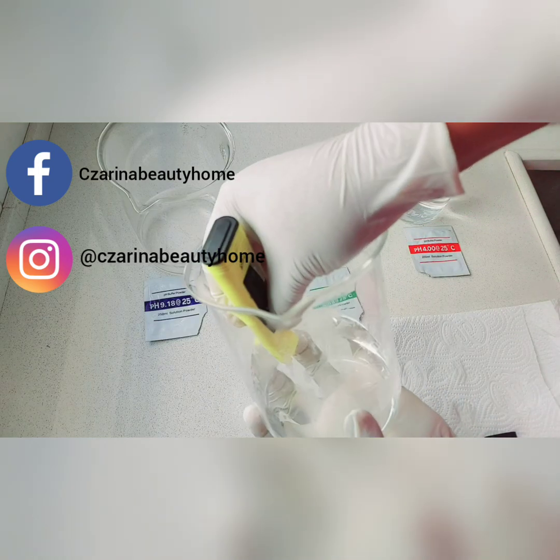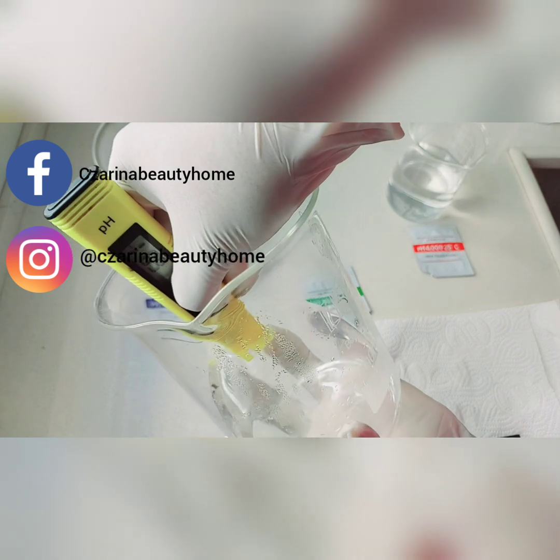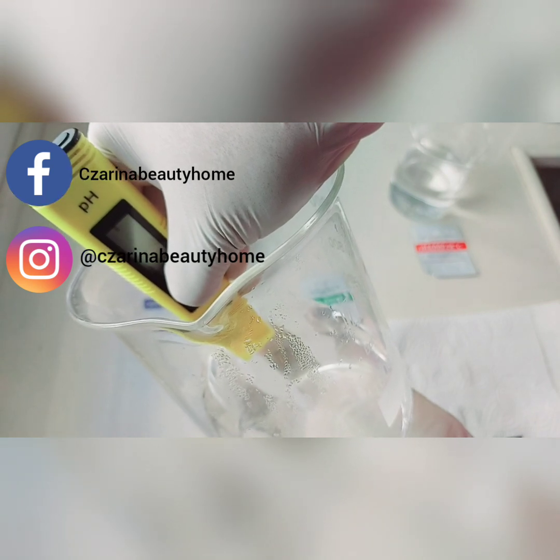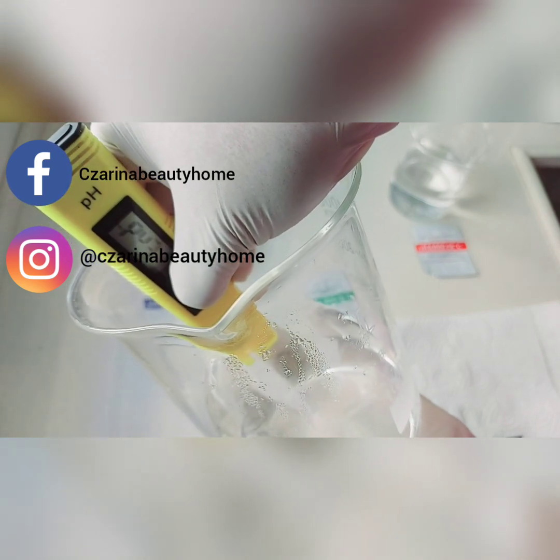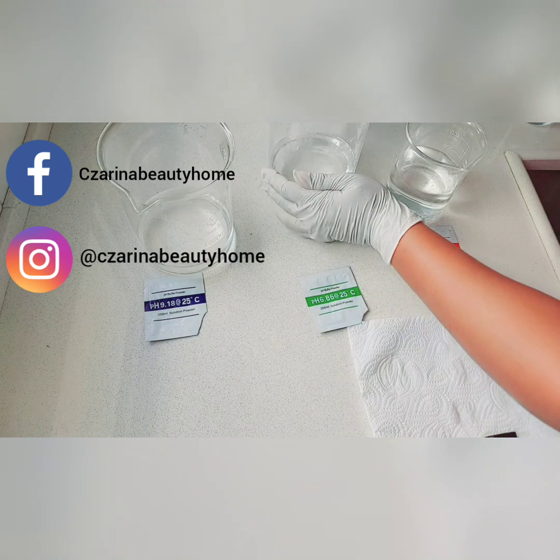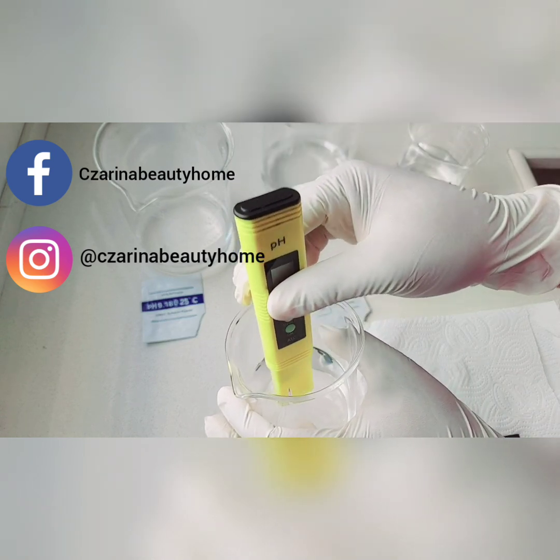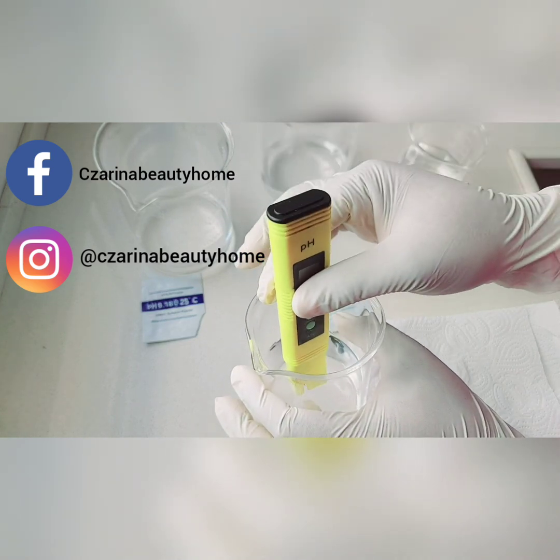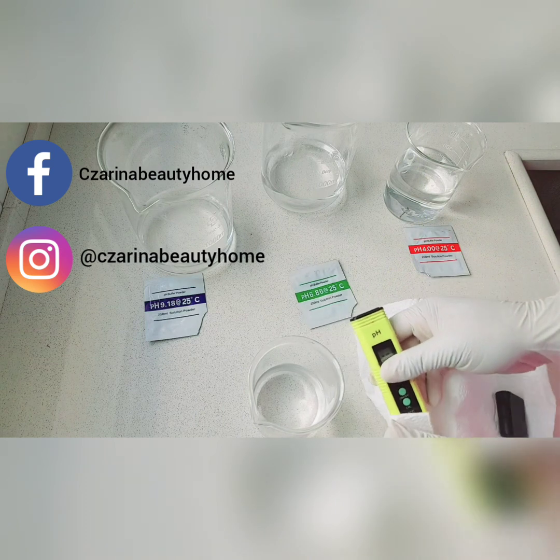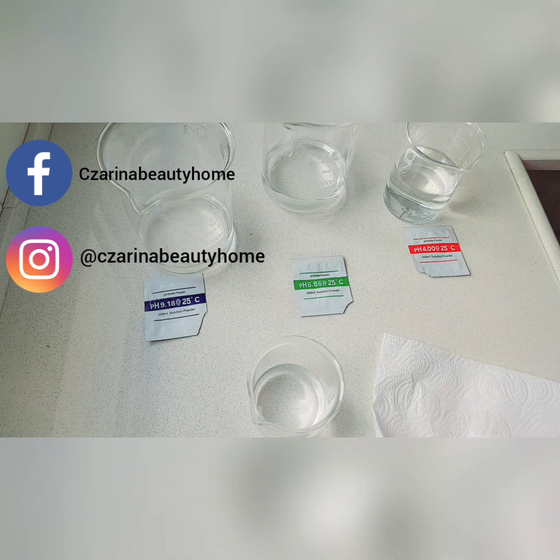That pH meter has two buttons: the one that says 'on' and the one that says 'CAC.' Once you dip it in and it's finished reading, you have to press the CAC for five seconds — count one, two, three, four, five — and it will read. Once it's finished reading, it will say 'end' on the screen, which means you've done that step successfully. Then take your pH meter and dip it into your neutral water without any buffer powder to clean it properly, being careful not to ruin the sensor underneath.